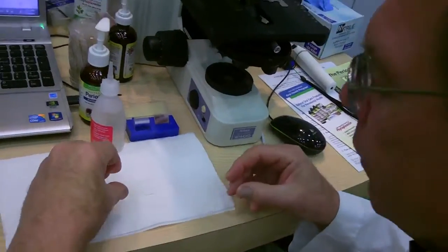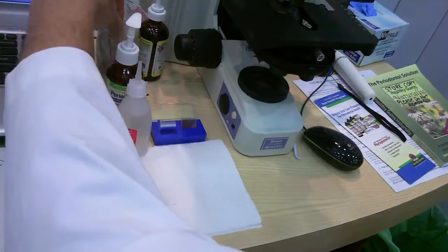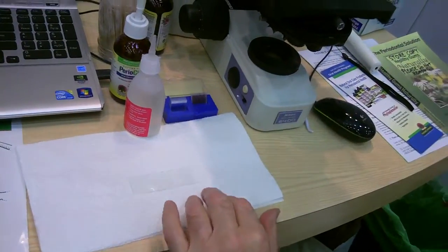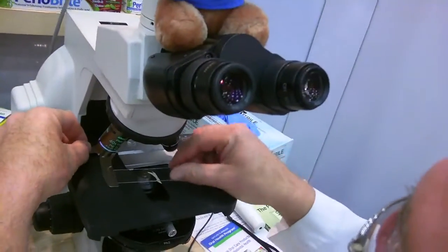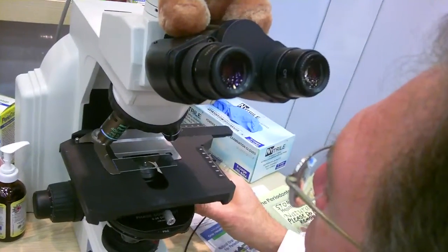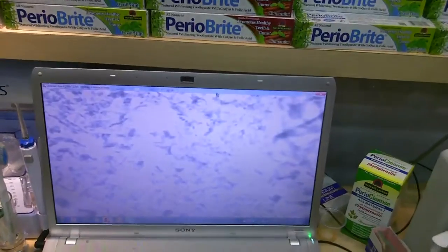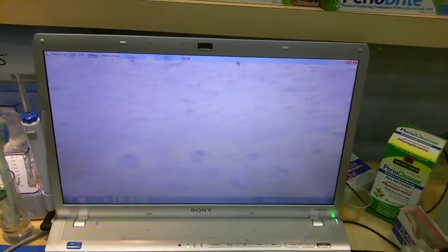I'm going to take a cover slip and put that on here, and take another toothpick and just press that down. This is a Nikon microscope, and it's a phase contrast microscope — very effective in showing what kind of bacteria are there or not there. So we're going to take a look right now and see.